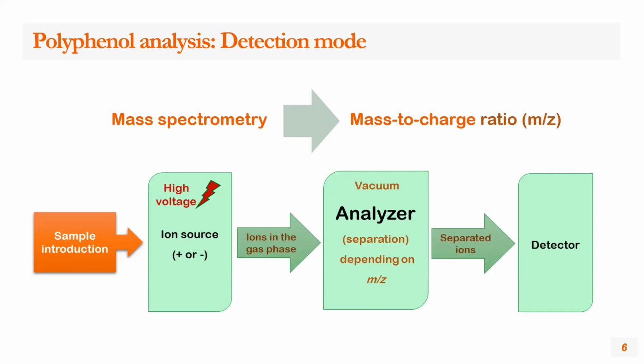Then this compound will go inside the mass spec, and we might be interested in fragmenting that compound. If we fragment it, it gives different parts of this compound, and the mass spec can read the ionized parts. We can think about it as a puzzle. We have a compound, and then it splits into puzzle parts. These puzzle parts we can put together to know which compound is there, for identification, for example.